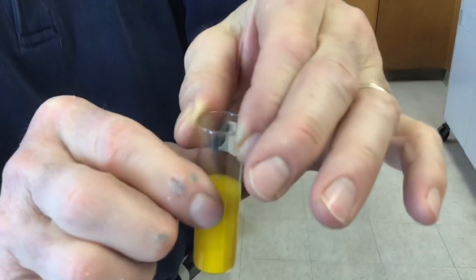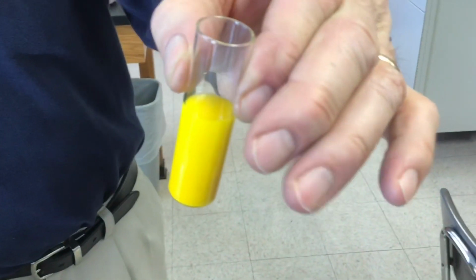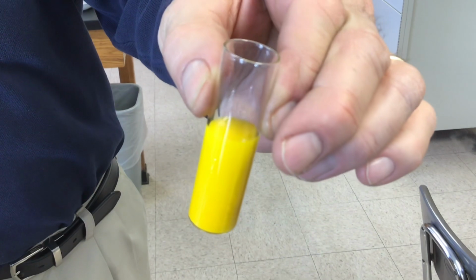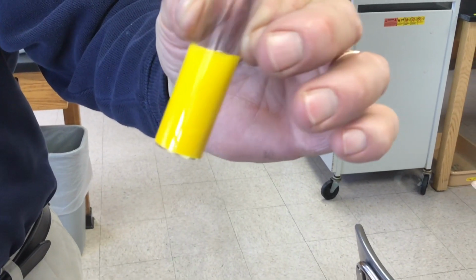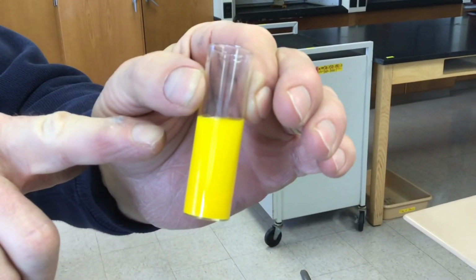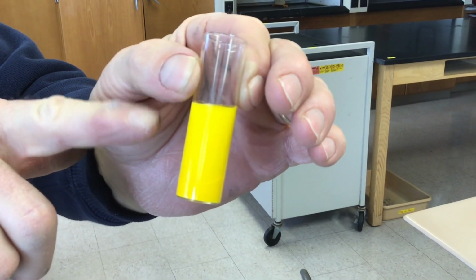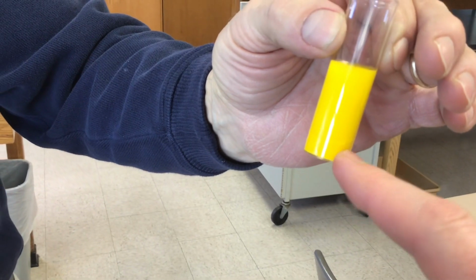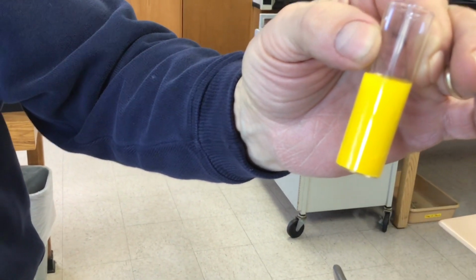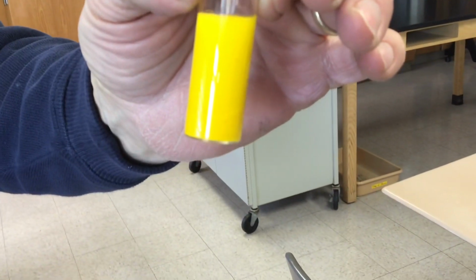I don't know if it's happening or not. When you look at it from the top, it looks like maybe the sides of this vial are coated. And so we're not going to see it really settle because we can't see through the coated sides. The top is looking a little bit more transparent now. I think on the bottom too, right around there, you can see the solid starting to pile up. You can see that with the camera.